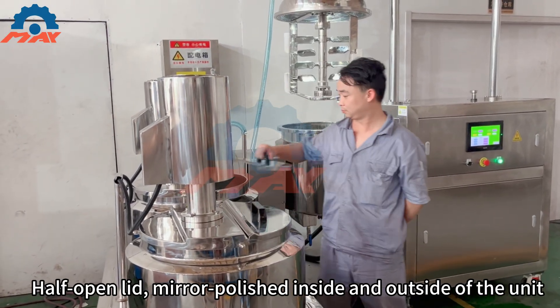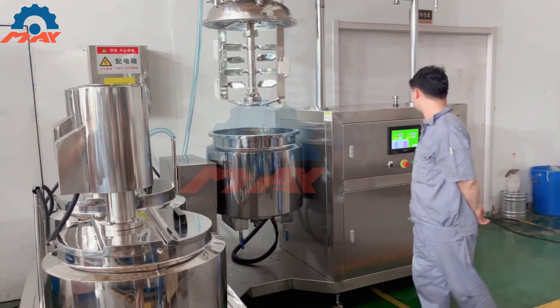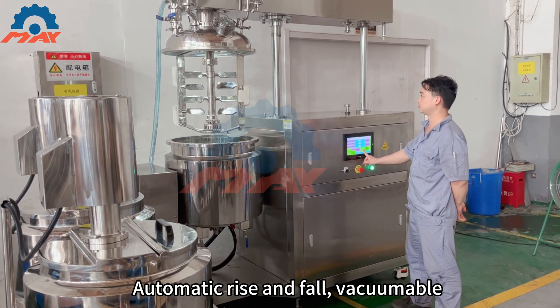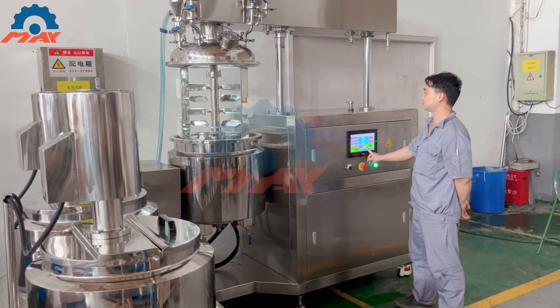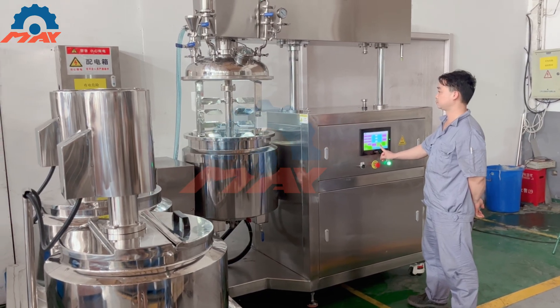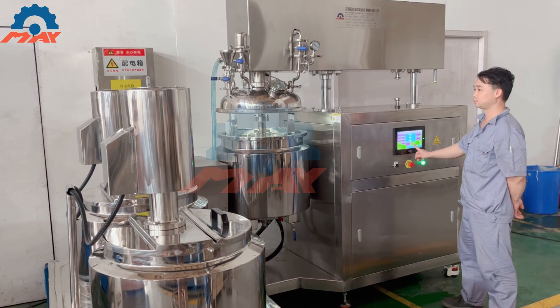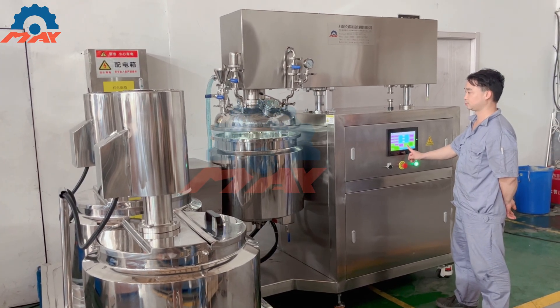Hydraulic pump and workers safety protection included. Maxwell is a leading supplier of professional vacuum emulsifier homogenizer mixer machines in China. Our mixers are widely utilized in the cosmetic, pharmaceutical, food, and chemical industries for creating cream, ointment, lotion, and emulsion products.